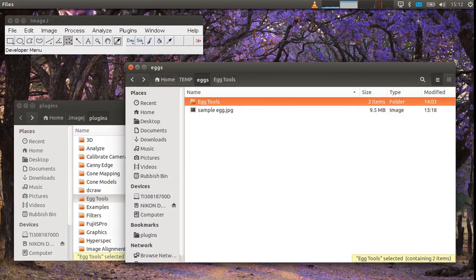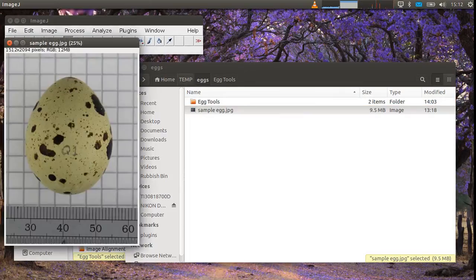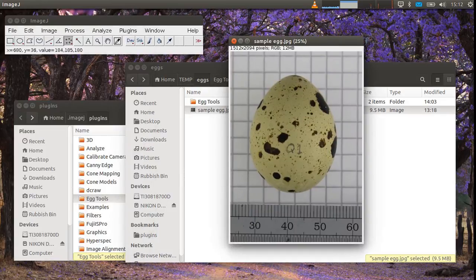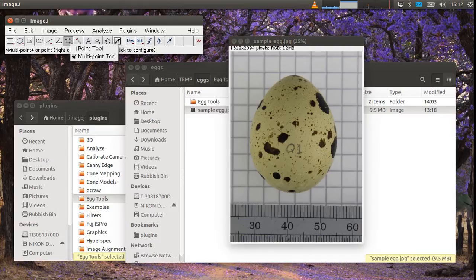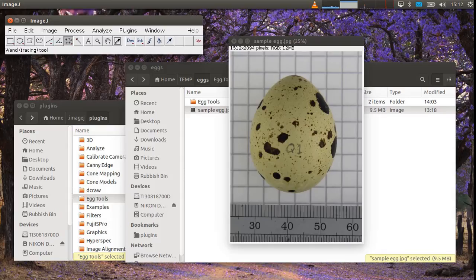I'm going to show you an example with this sample egg image. This is a quail egg. And what we need to do is select the multipoint tool. So here you've got the point tool and multipoint tool which you can change between by right clicking.